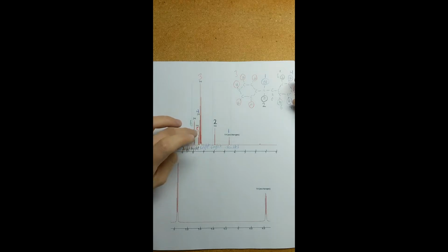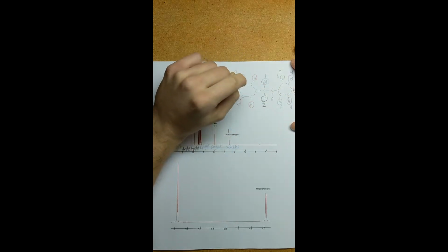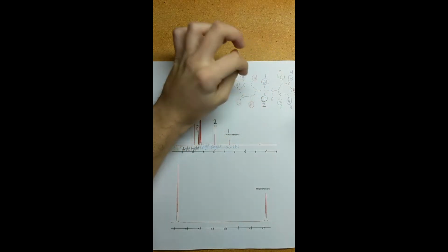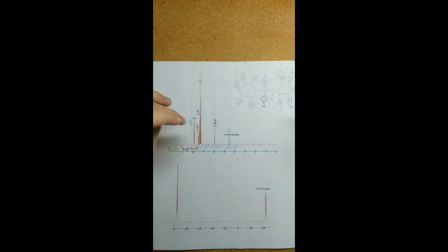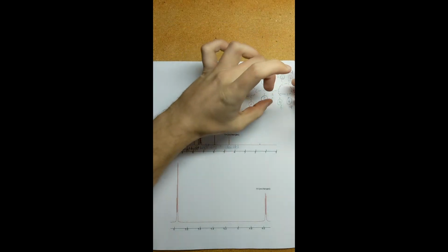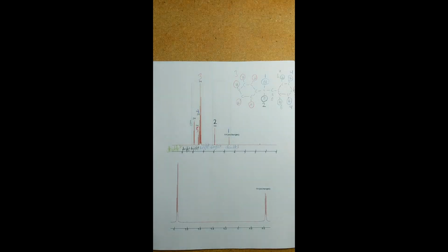Moving more downfield, or the more deshielded, at this integration of 1 hydrogen would be this outside hydrogen labeled as number 5 here. Again, that is due to its symmetry and proximity to this double bonded O, and potentially even where this OH is coming in. And finally, our most deshielded hydrogens would be these two labeled as number 6 here, because they are in direct proximity to this double bonded oxygen.